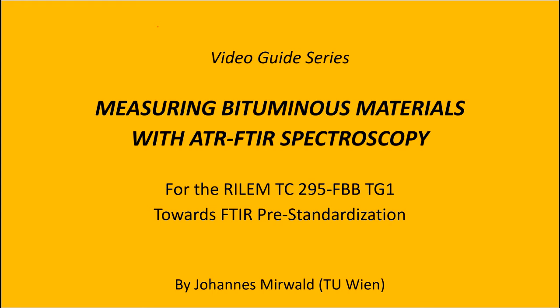Welcome to the video guide series for the task group 1 of the RILEM TC 295 fingerprinting bituminous materials. In today's video, we're going to talk about measuring bituminous materials with ATR-FTIR spectroscopy. The device used in this video is a Bruker Alpha 2 as well as its respective software, Opus.